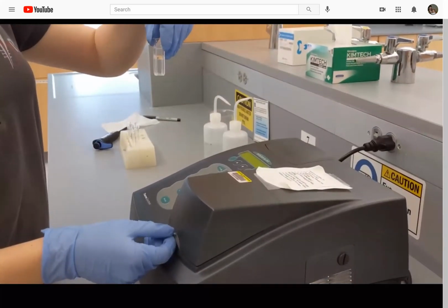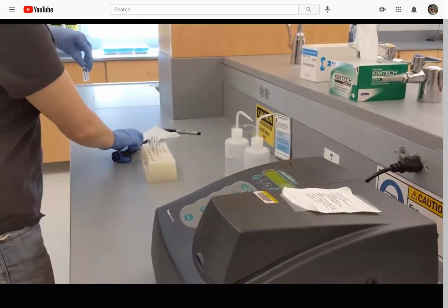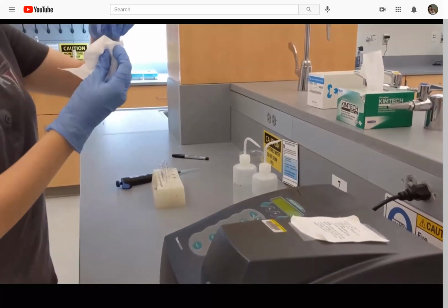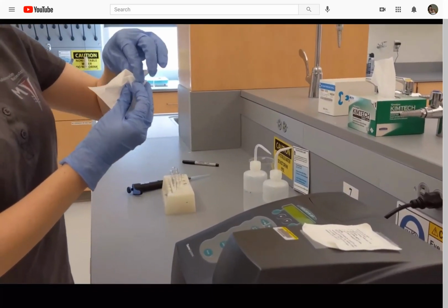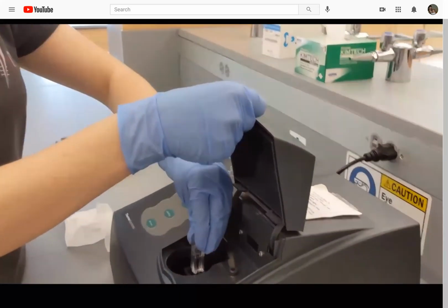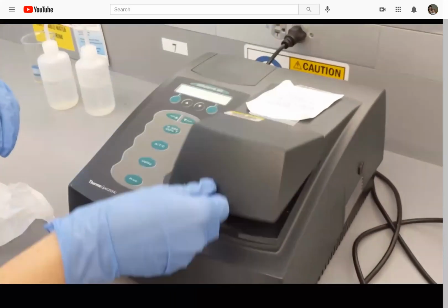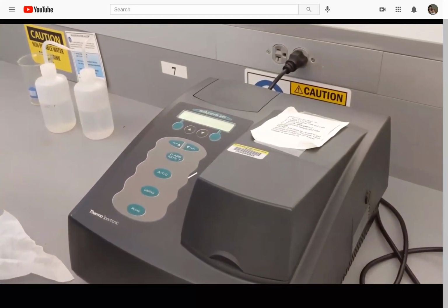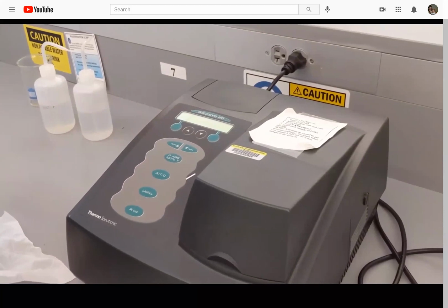So I'm now going to wipe my cuvette off to make sure there's no fingerprints or smudges on it, or water droplets for that matter. I'm going to insert it into my spectrophotometer and measure the absorbance.